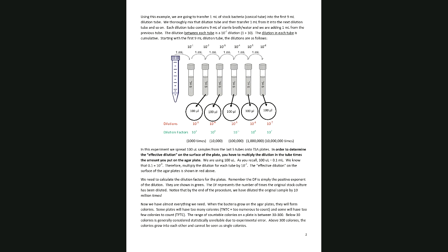Remember, microliter is 10 to the negative 6. Milliliter is 10 to the negative 3. And so, yes, Maria. So what you would do is just simply move the exponent to the left 3 places, and that gives you 0.1 milliliters. Right? So 100 microliters is equivalent to 0.1 milliliters. Well, we already know 0.1 is 1/10. 1/10 is 10 to the negative 1.